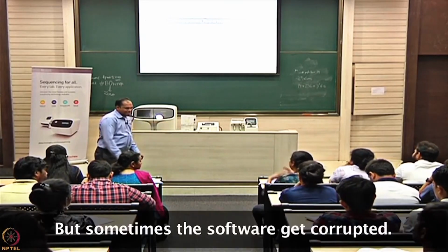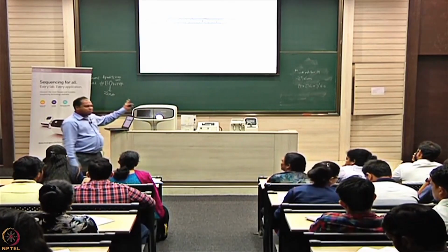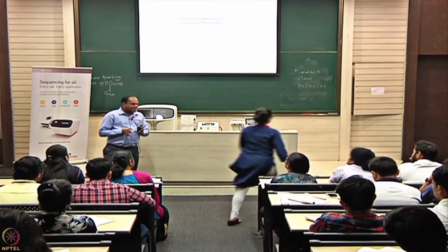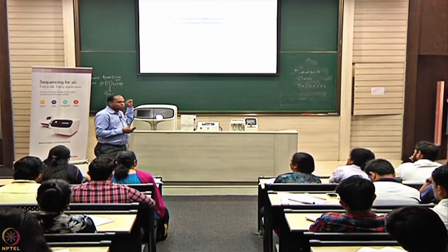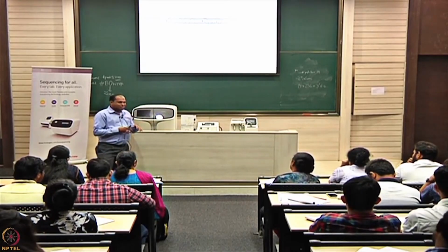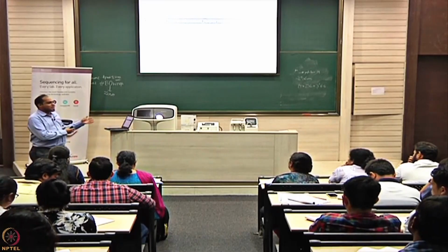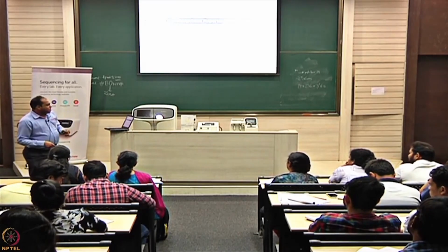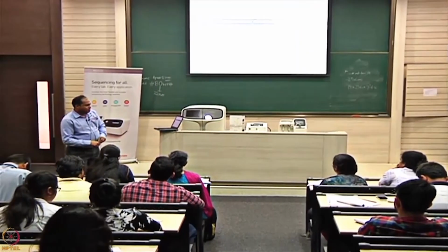Yeah, because sometimes the software goes... Right. Over here we have everything on the system itself. And what we have done is, it is like an appliance. It's like your toaster kind of thing, where you are just putting in your data or doing sequencing and generating your data. You can't touch that particular system anywhere. You have to just access it through a web browser only. So nobody can access it externally unless there's some service person coming in and doing something. So we have some data coming out, take it and do the analysis on the cloud.